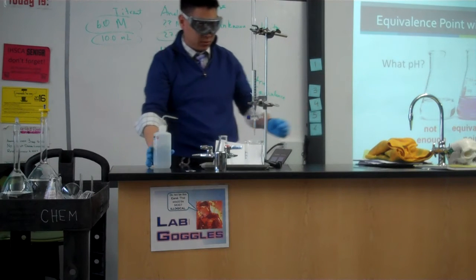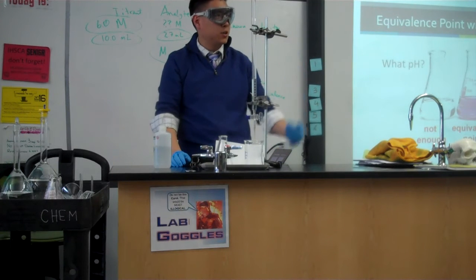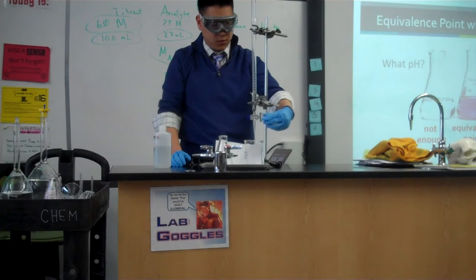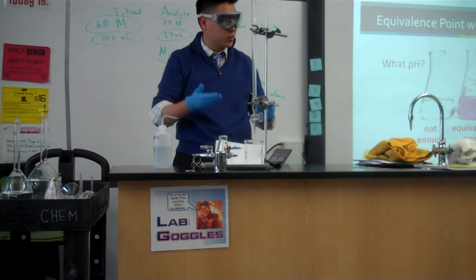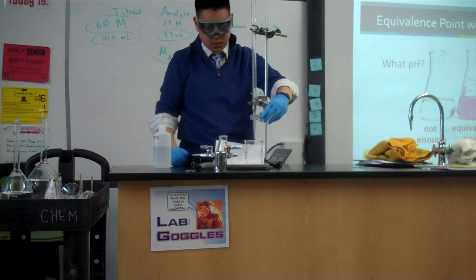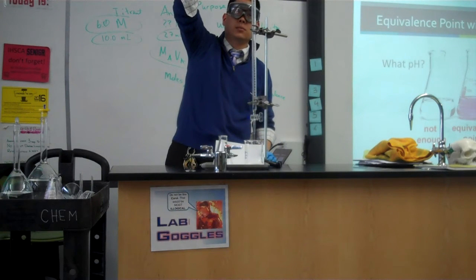Okay. Now we're going to release some of this. If it's completely vertical, it's going to drain as fast as possible. If you want to slow the drip, you can change the angle very slightly, so it goes drop, drop, drop, drop, drop. But for our purposes, we're just trying to clear this out, evacuate it, cleaning it.